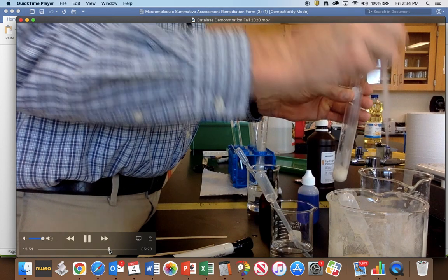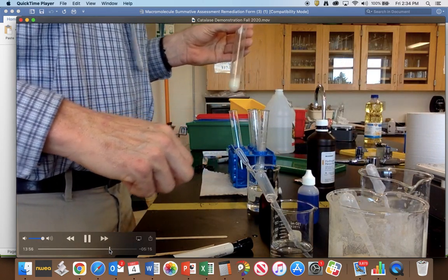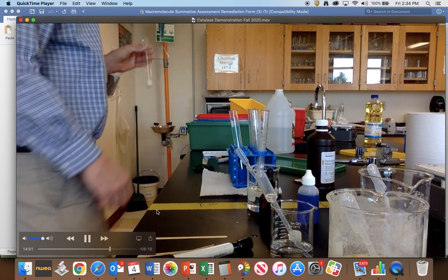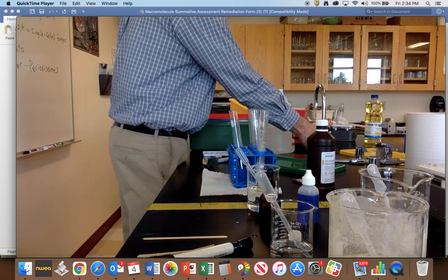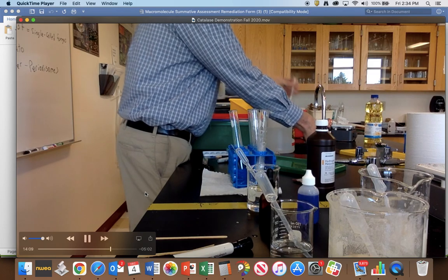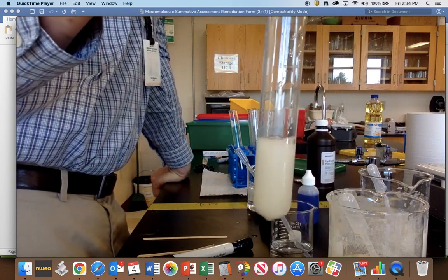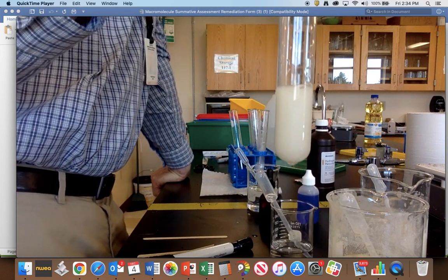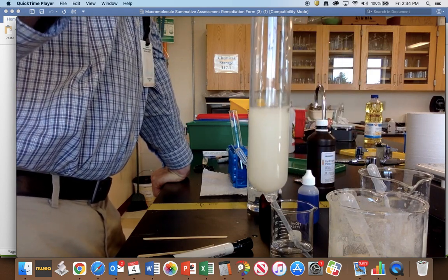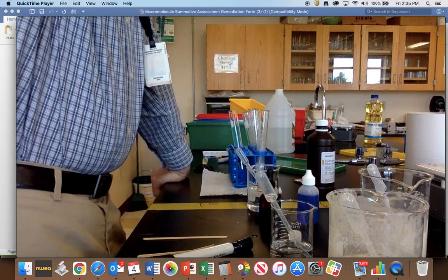All right. This is adding some of the good yeast, so the living stuff. I'm going to add a little water to it to see if the catalase is specific for a specific substrate. So is it specific for hydrogen peroxide, or will it break down water? And that shows there is no reaction, so it's not breaking down the water. So that shows it's specific for a specific substrate.